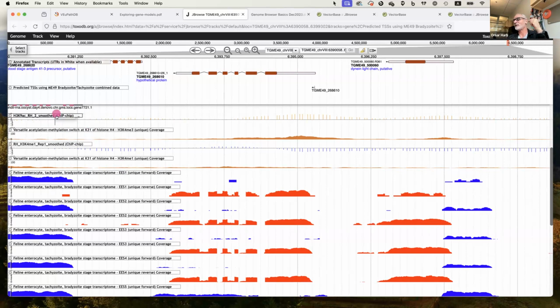In the case of ChIP, you're using a microarray, just like the old glass microarrays that were used for looking at expression profiles. You're using a similar array to determine where in the genome your particular protein bound. In the case of ChIP-seq, instead of a microarray, you're sequencing, just like you would do RNA or DNA sequencing, and then you're mapping the reads back to the genome. Wherever you get a pileup of reads, that tells you that's the region where the protein was bound.